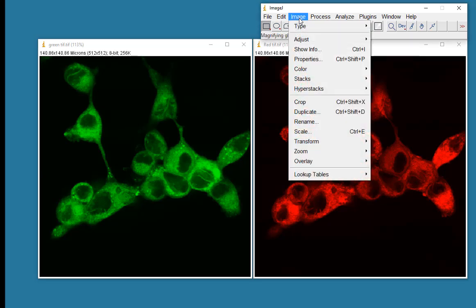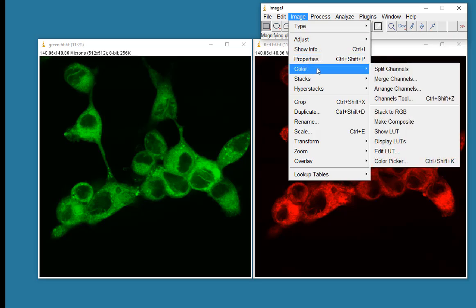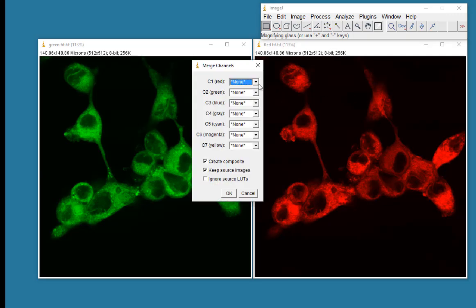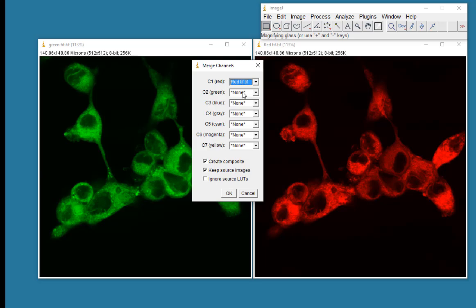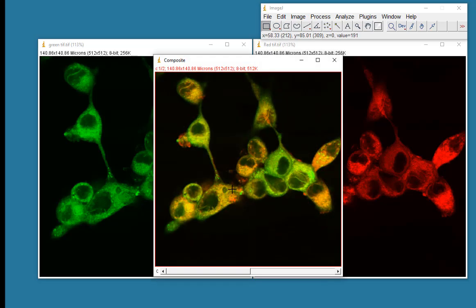So the way to do that is to merge the channels. So if we go to Color and Merge Channels, I will make my red image my red tiff. Sorry about the noise outside. My green tiff there. I will keep the source images and create a color image.